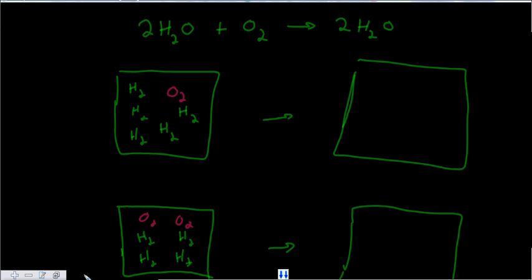Okay, today what we'll be discussing is a lab that we're going to do tomorrow, which is the Ratios of Reactants Lab. Basically, a method for us to determine in what ratio two reactants react together in a balanced chemical equation. We can test this using the method of continuous variation, in which we use varying ratios of one reactant versus another to find which one gives the maximum amount of products, okay?